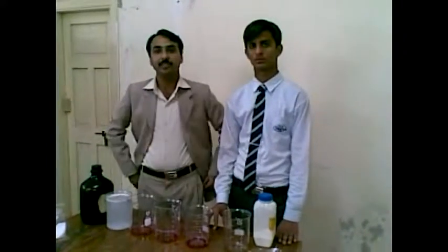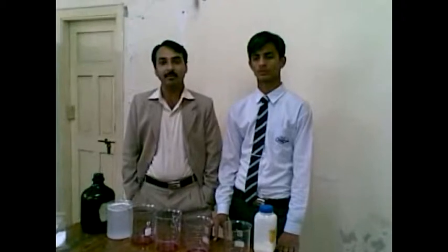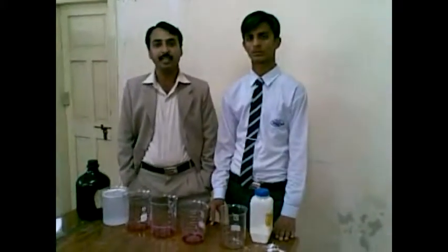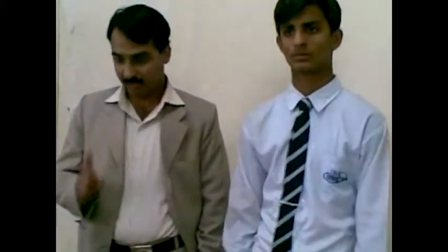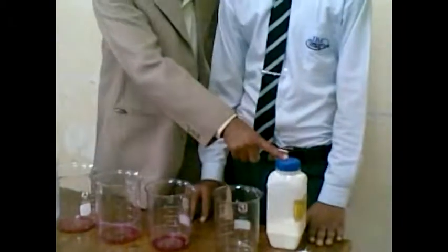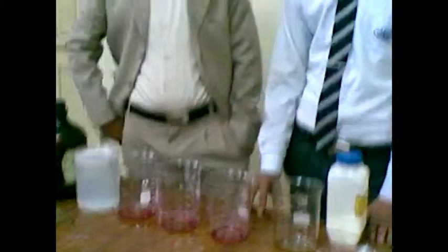So this practical is named the changing of the color. It is not a harmful practical. It can be performed everywhere with the help of these chemicals: acetic acid, sodium carbonate, phenolphthalein, and beakers. Thanks.